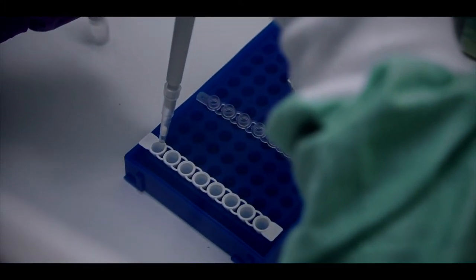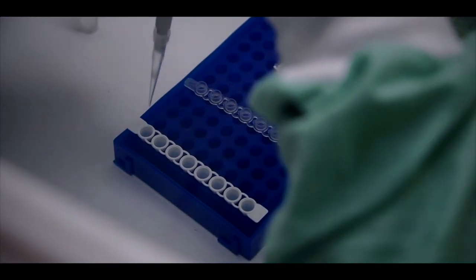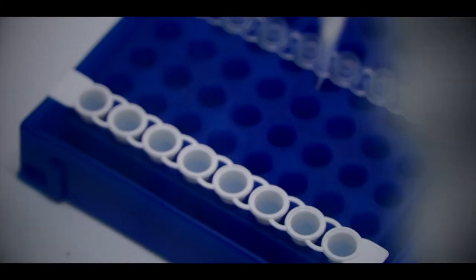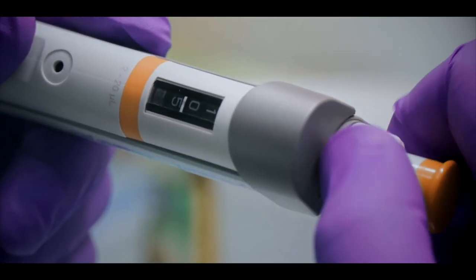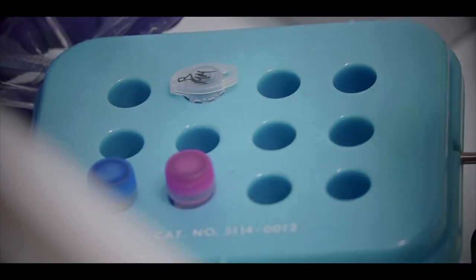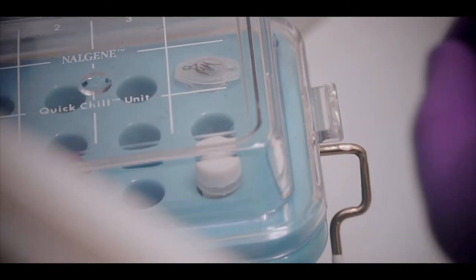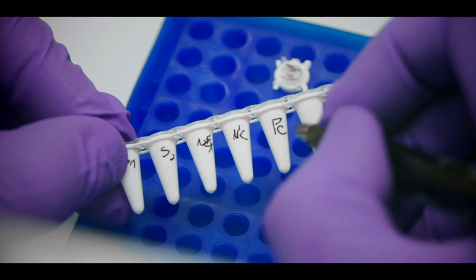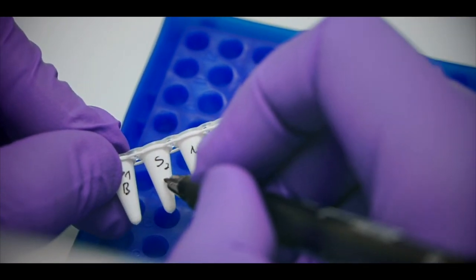For this experiment we have three samples, and we are also including two controls: the negative control and the positive control. We will now add 10 microliters of the negative control. We are done with the master mix preparation and addition step. The next step is to add the RNA template before we can proceed to amplification.